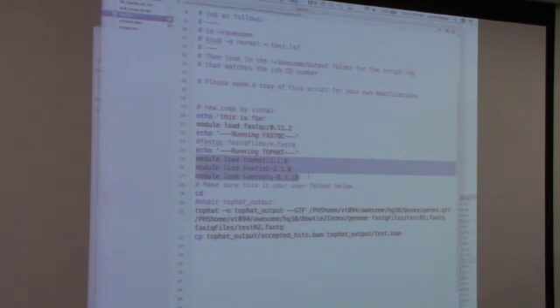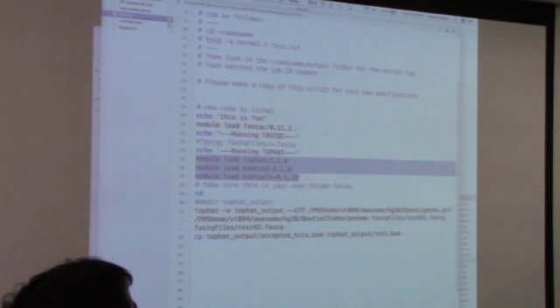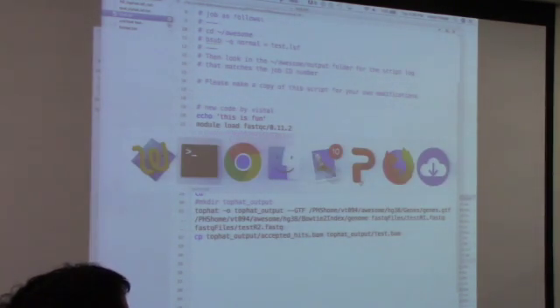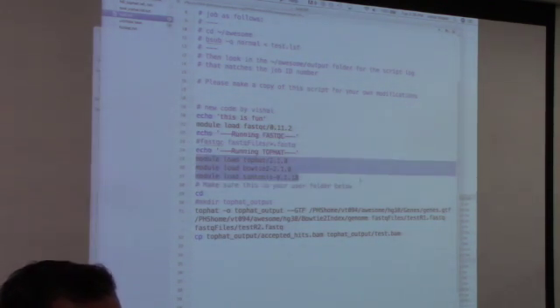So, while this is copying and you are fixing this, let me quickly go over the homework. Now you have your index, you have your homework. Your homework is to run the STAR aligner instead of TopHat. That's your homework for this week. And the second part of the homework is to read the manual for STAR and for TopHat.